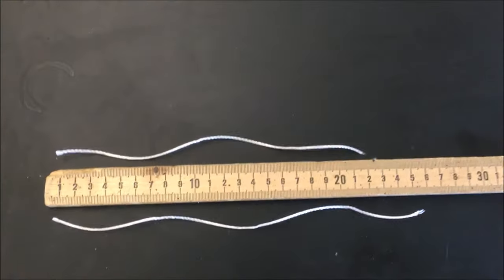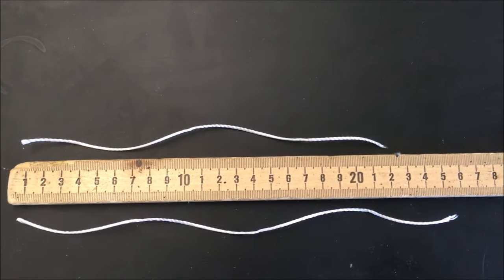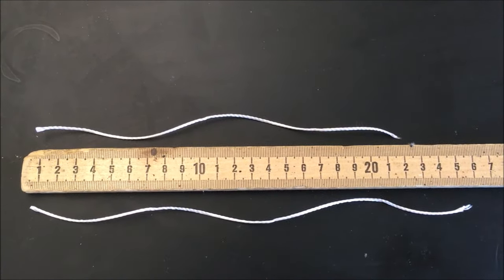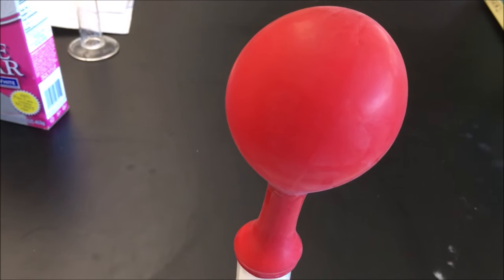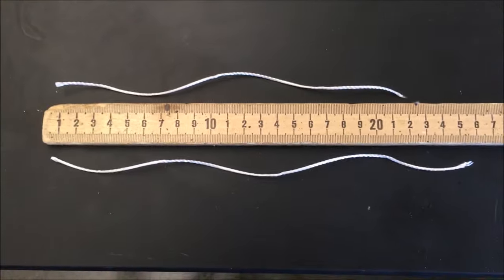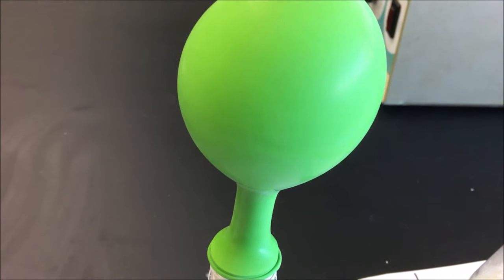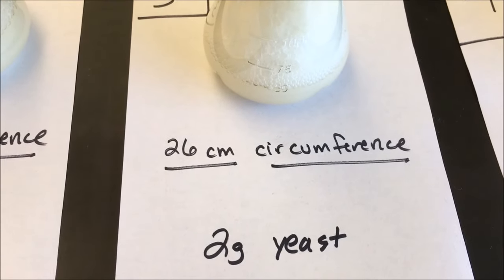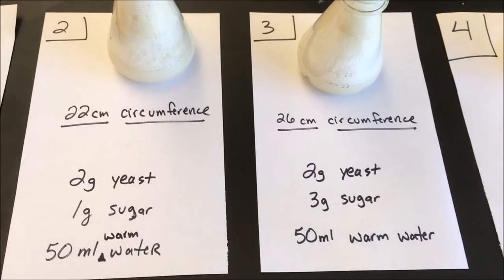Here you can see the results. These two pieces of string — the one on top I wrapped around the red balloon from flask number two, and the one on the bottom I wrapped around the green balloon from flask number three. The string for flask two, when pulled tight, comes to a circumference of about 22 centimeters. The string for flask three comes to about 26 centimeters. So the balloon in flask three has a larger circumference — 26 centimeters versus 22 centimeters — allowing me to quantify my data with a numerical value.